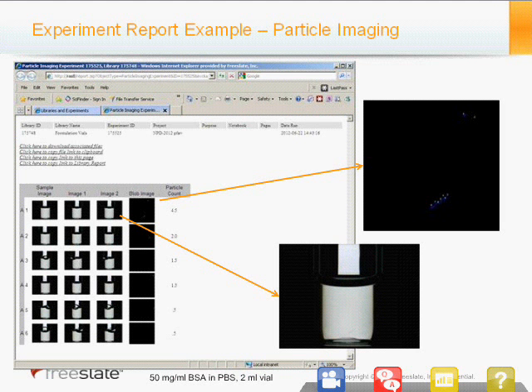In this case, I didn't clean these vials particularly well, so you can see this first vial here is detecting what looks sort of like a fiber in the sample. And in the blob image, because of the aspect ratio of that fiber, which might be on the thin side, it's kind of breaking that fiber up into smaller particles. And that's part of the binarization process that I mentioned.